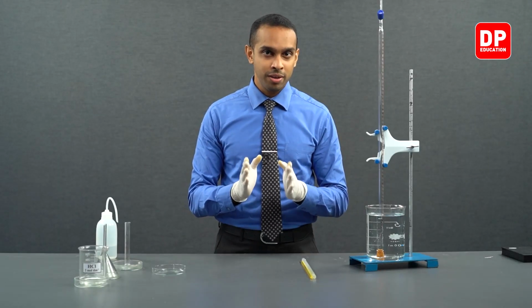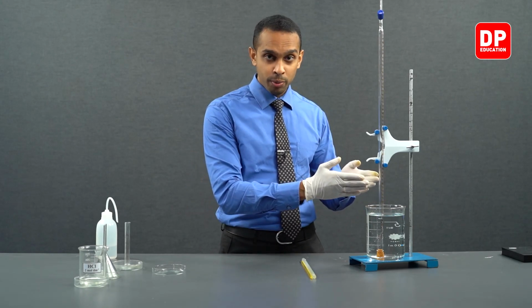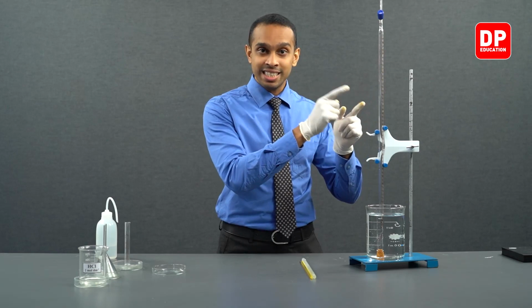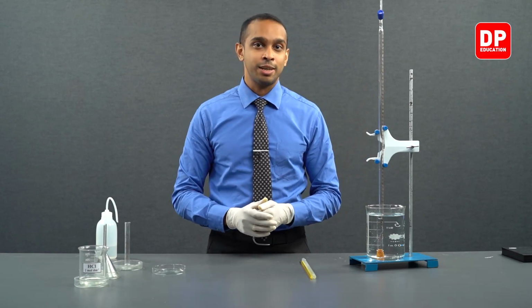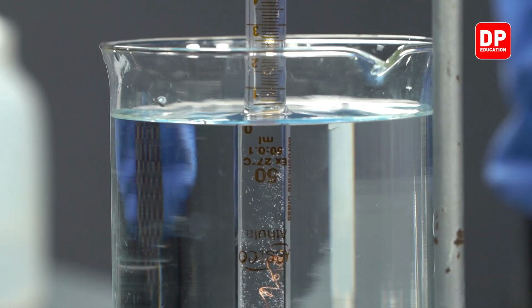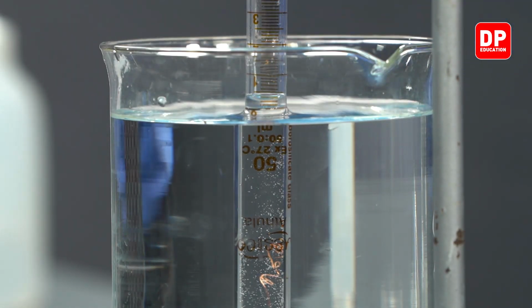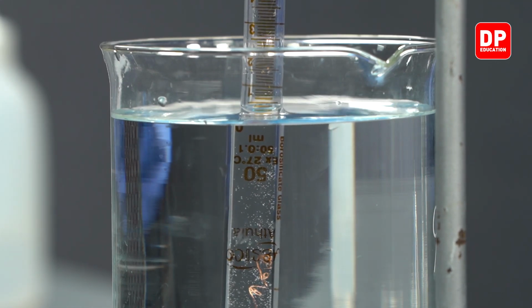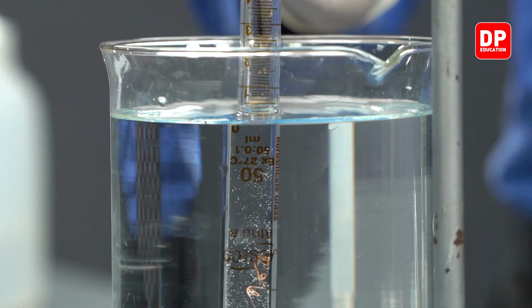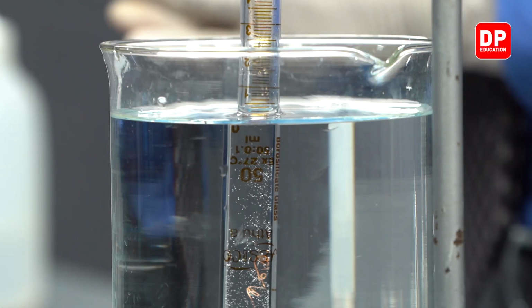However, just like in the previous trial, we have to keep in mind that when the water level of the burette is below the water level of the beaker, that means the pressure of the gas inside the burette is not at atmospheric pressure. So we have to lift this burette up until the water level of the burette aligns perfectly with the water level of the beaker. Now, the water level inside the burette and outside the burette is aligned perfectly.